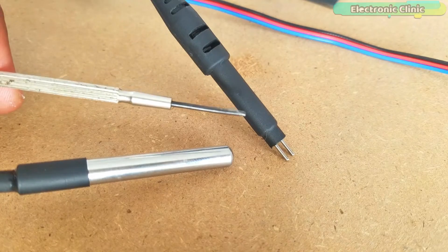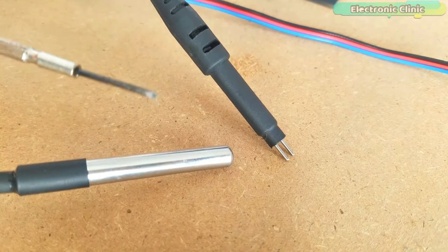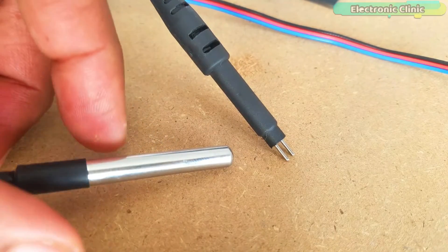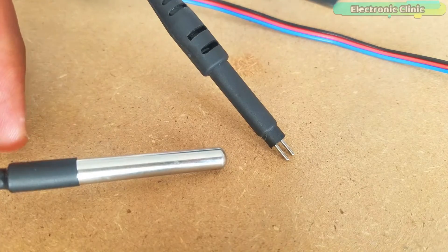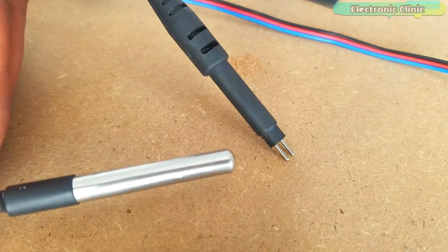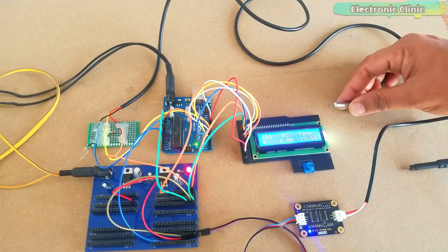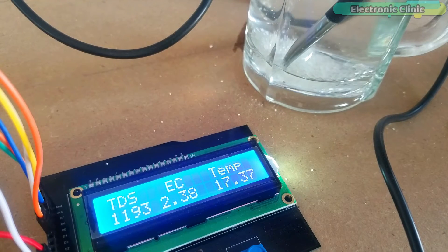This TDS probe has no temperature sensor, so I am using the DS18B20 waterproof one-wire digital temperature sensor for temperature compensation. This is important for accurate values. Although the temperature compensation algorithm is included in the sample code with a default value of 25°C, I highly recommend using a temperature sensor for accurate values. Note that zero PPM is the most ideal result, and TDS meters cannot detect non-ionic particles like sugar, as demonstrated here — the value almost remains the same when adding sugar.